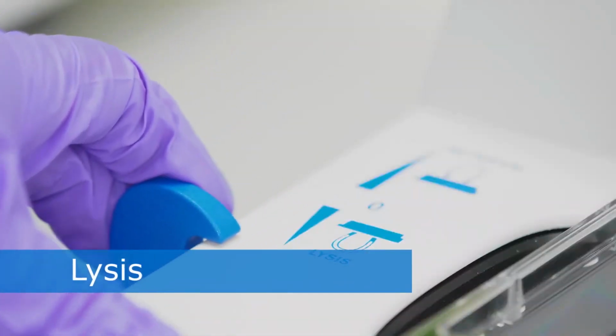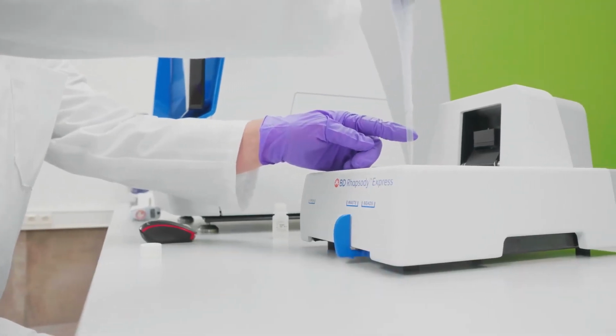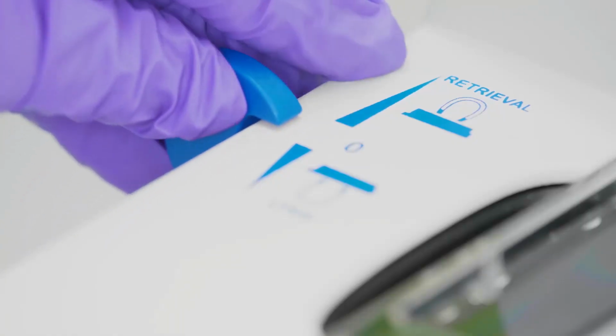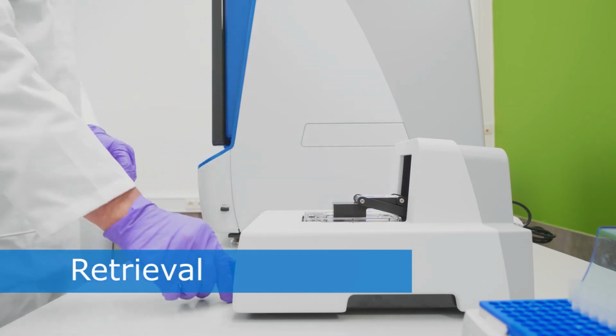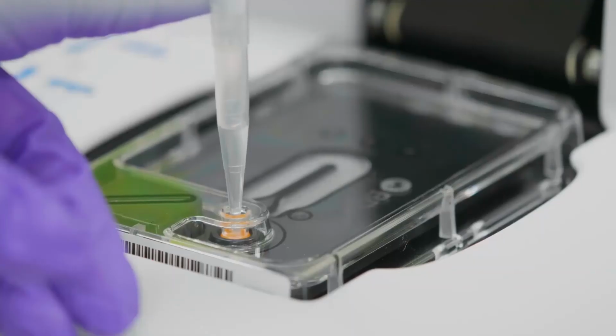To lyse the cells, a magnet is applied from below the cartridge in the Rhapsody Express Station, and the lysis buffer is added to the cells. Once cells are lysed, a magnet is applied from above the cartridge, which leads to the migration of the magnetic beads out of their individual wells to capture them at the top cover of the cartridge. A collection tube is put into place to collect the beads when washed out of the cartridge. Once this step is finished, a final image is taken to monitor the efficiency of the bead retrieval step.